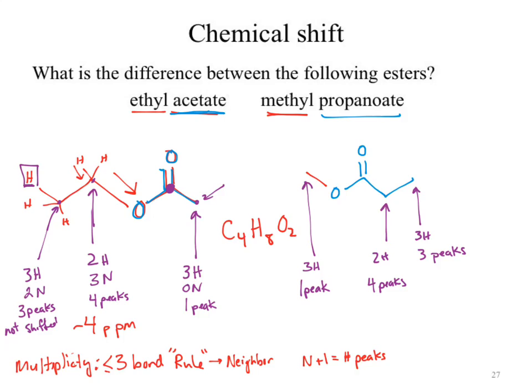That's a carbon bound to a carbon bound to 2 oxygens. So we might expect a shift there, but would we expect as much of a shift as we saw for the middle one? No, because it's still carbon to carbon, not carbon to oxygen. So we might put this one as our middle signal, for lack of a better description.